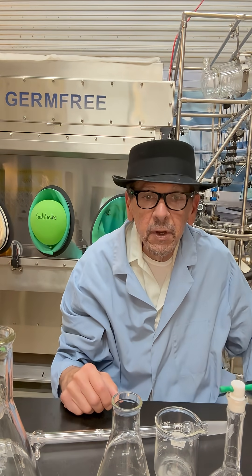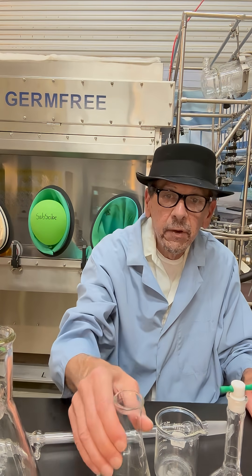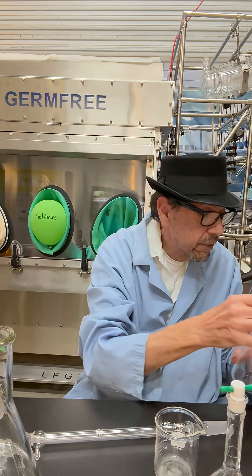Hey folks, today we're going to identify some classic chemistry glassware. Here we have what's called an Erlenmeyer flask. This is a 500 mil.